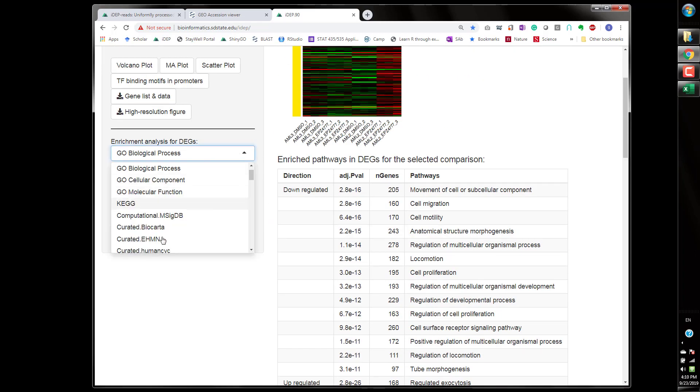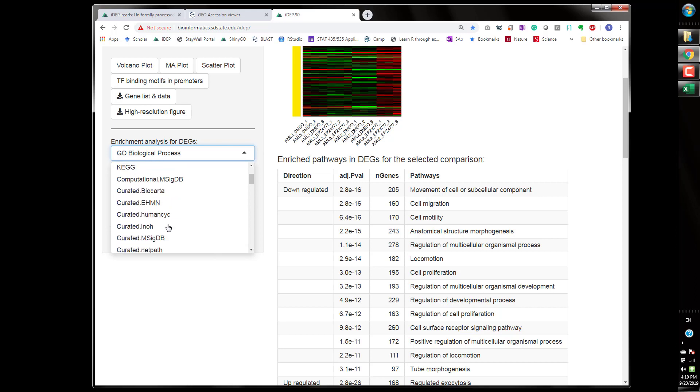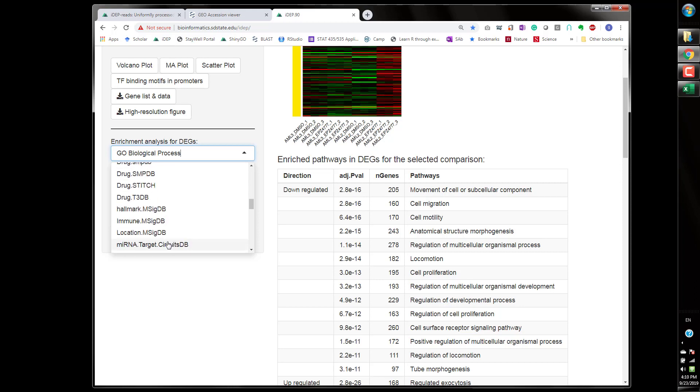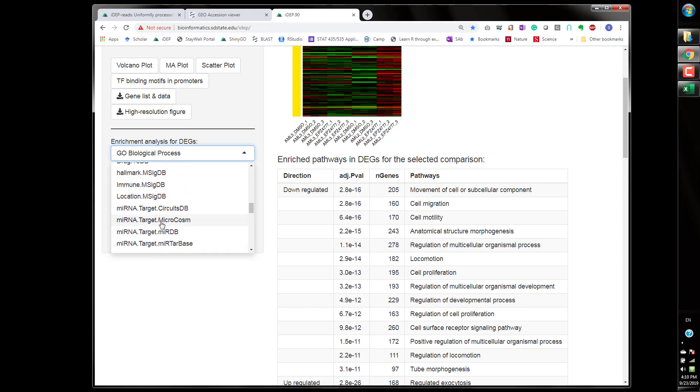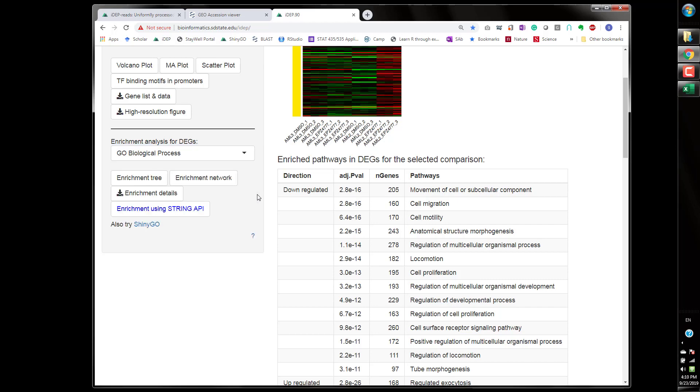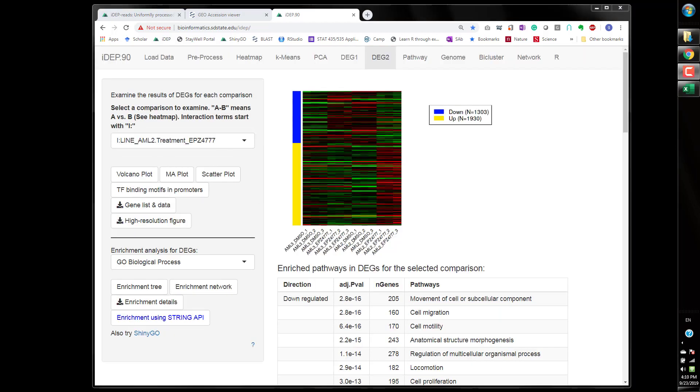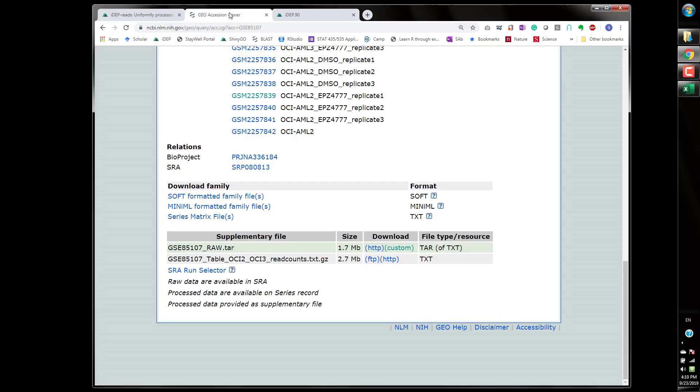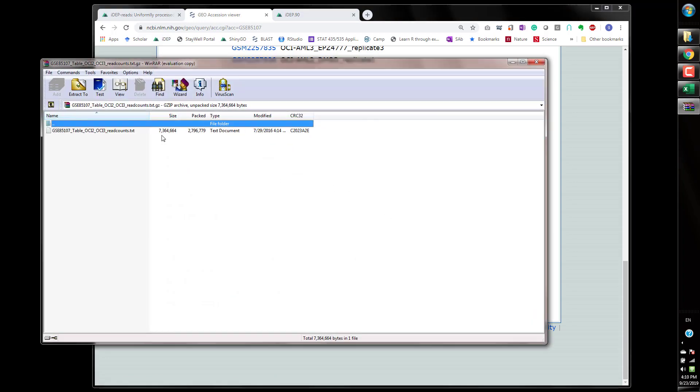So you can annotate these genes further you can change different databases. Obviously if you want to dig deeper into the gene expression regulation you can choose the transcription factor target genes and also microRNA target genes.